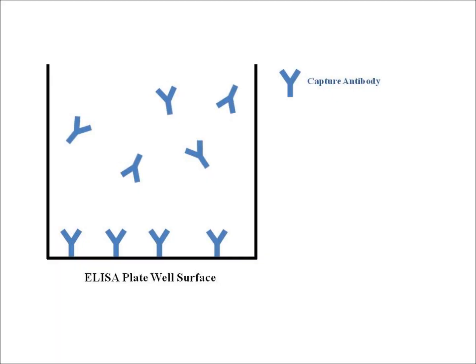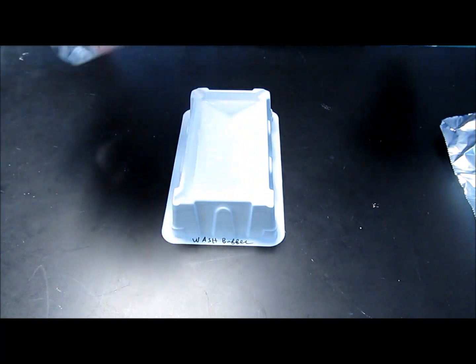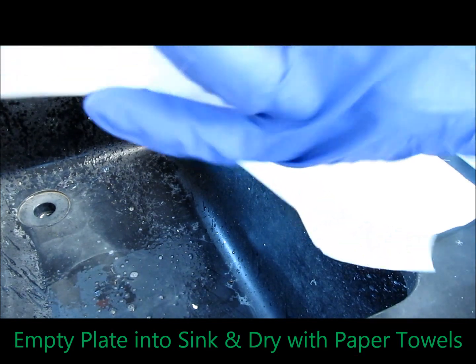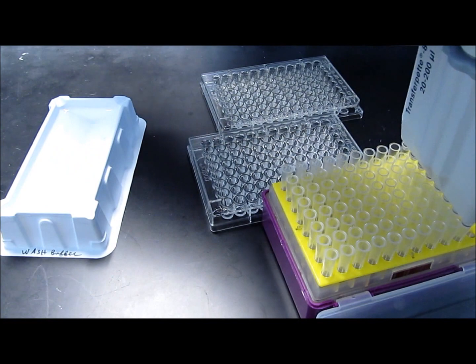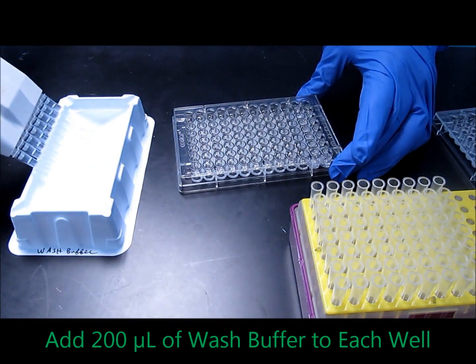What will happen is the capture antibodies will adhere to the plate and some will remain in solution. The next day, we're going to wash our plate three times with PBS to remove any unbound capture antibody from the wells. To do this, you're going to need some wash buffer, which is PBS with a little bit of detergent called Tween 20. Fill up your reservoir, then take your 96-well plate and with a forceful thrust, empty out the contents into the sink and blot it against the paper towel. Set your multi-channel micropipetter to 200 microliters and start pipetting the wash buffer into each well.